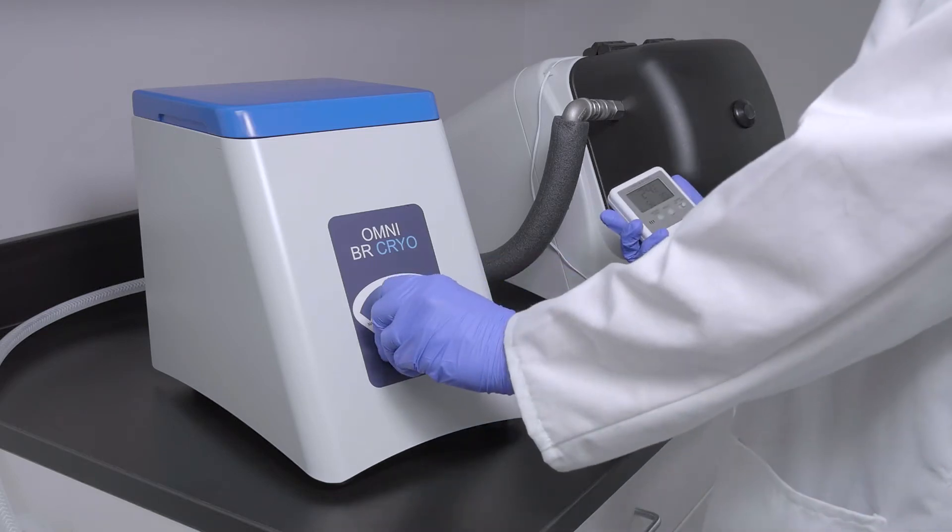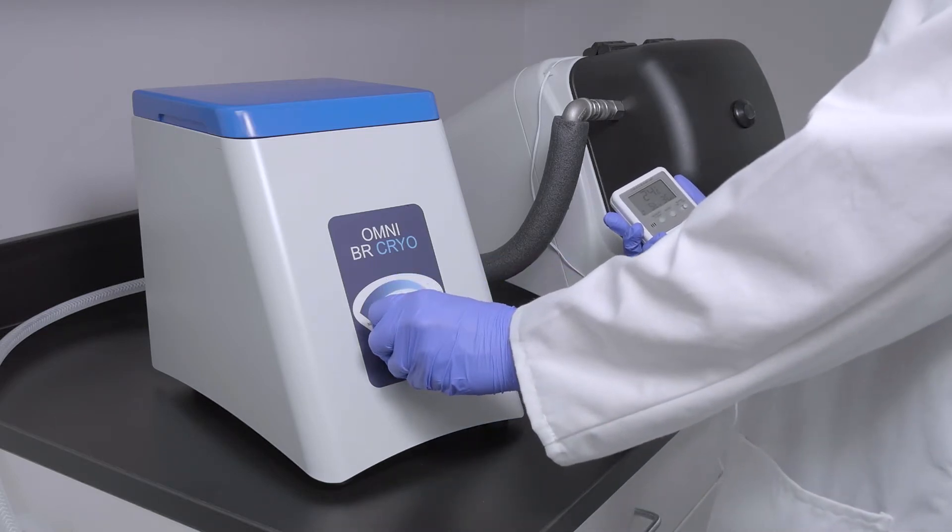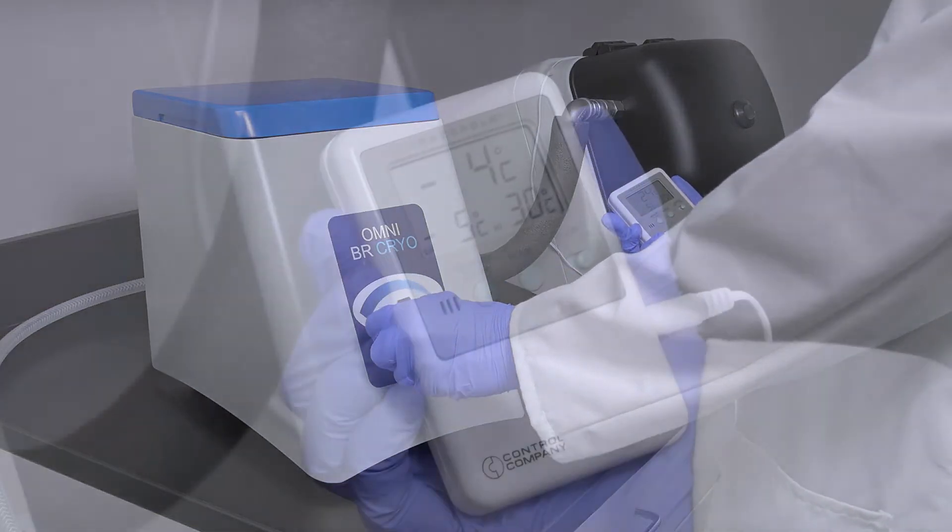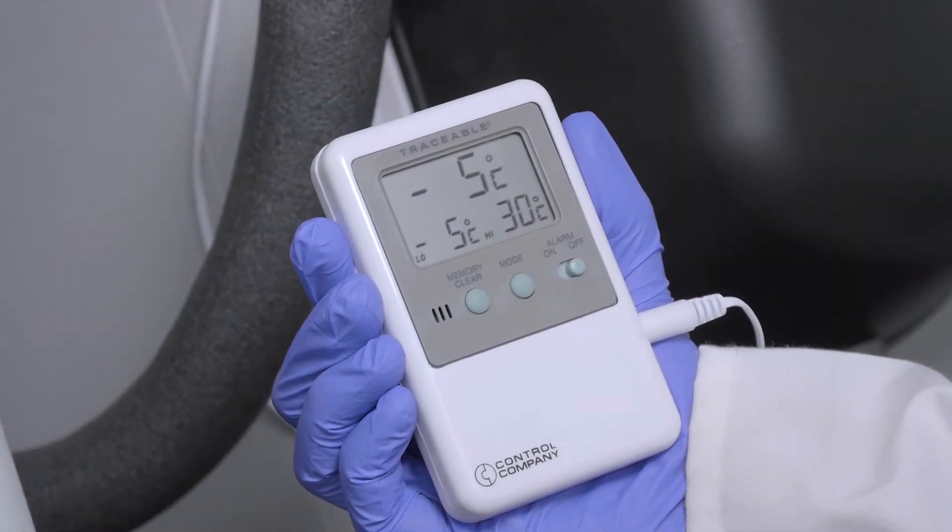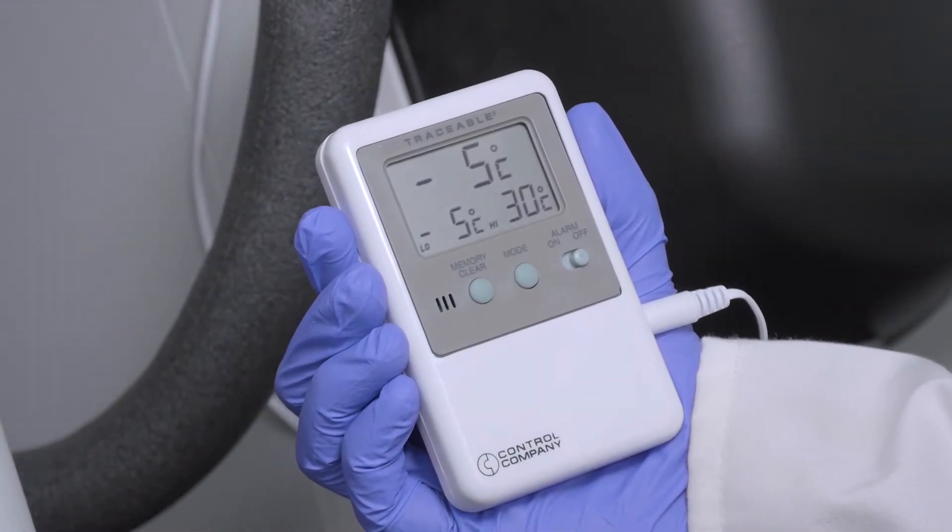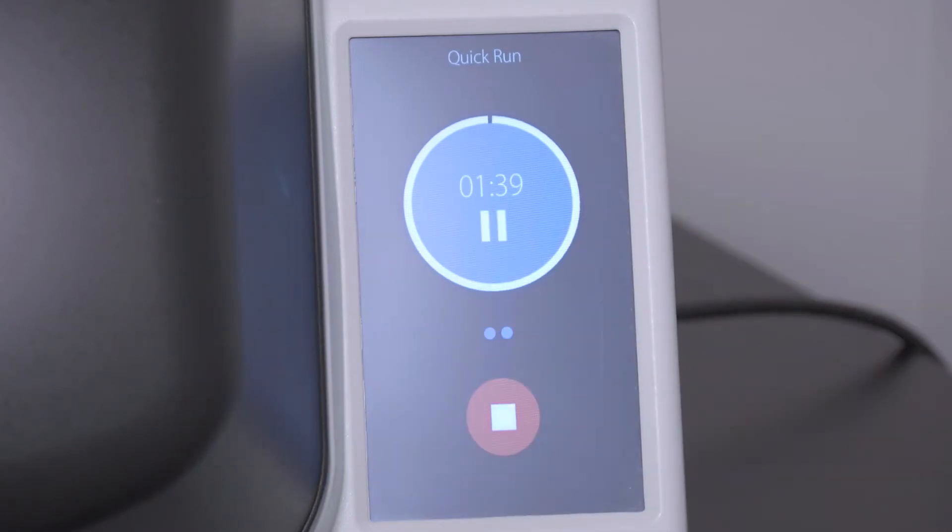Turn the control knob to begin cooling the processing chamber. When the temperature has reached negative 5 degrees Celsius, press ready to begin the processing cycle.